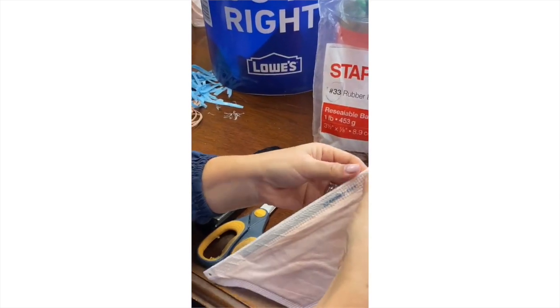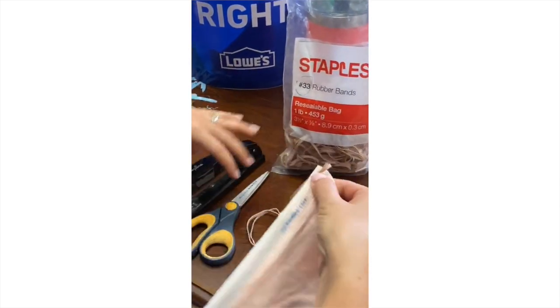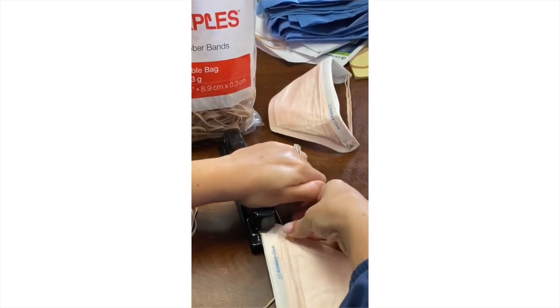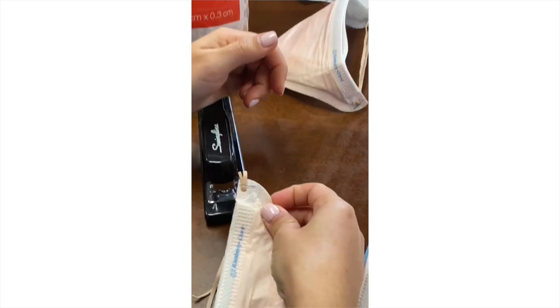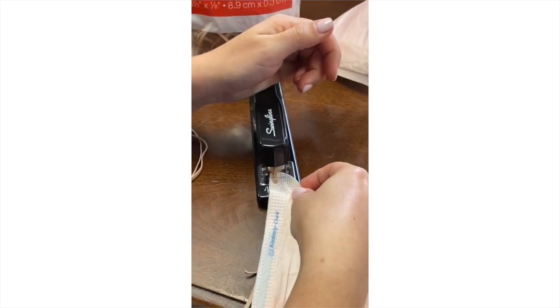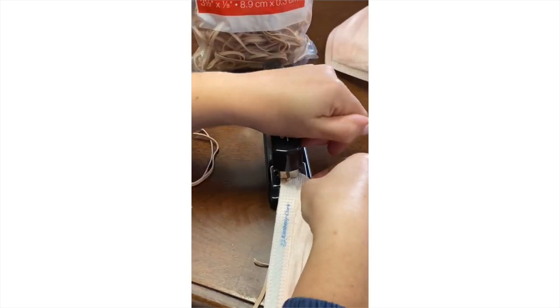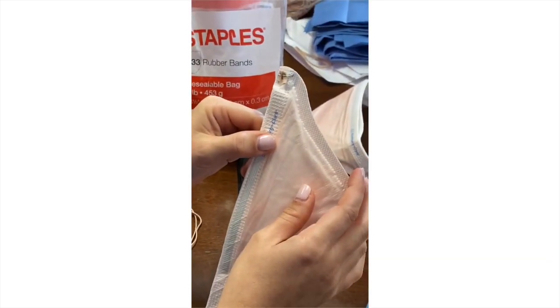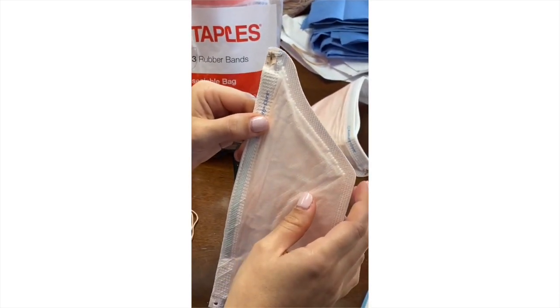Staple both rubber bands together to the mask, then fold the remainder tail over itself and staple again. Do this same thing on the other side of the mask through the other hole.